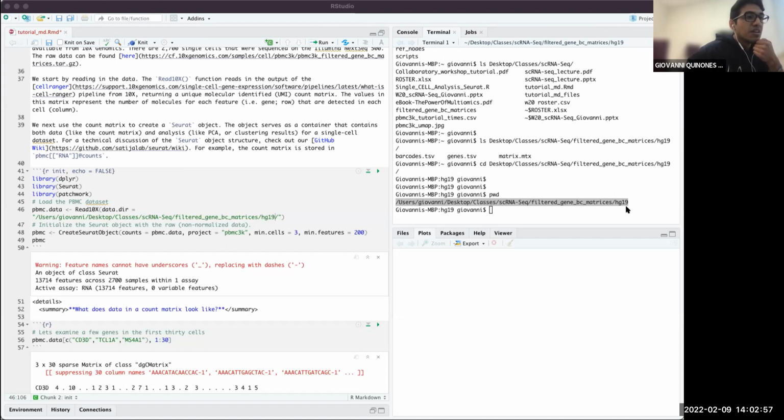I see. Okay, yeah. So what I forgot to mention is that this Unix command line, what I was doing here in the terminal, will work if you have a Unix-based computer, like a MacBook. If you have a PC, I'm not 100% certain.